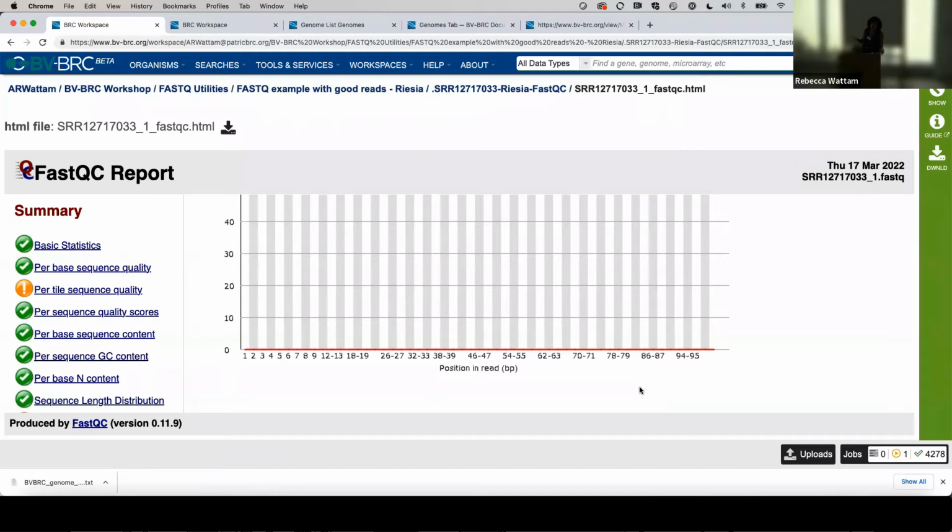WGS is whole genome shotgun, which is just, it's all in pieces and contigs. So when there's no gaps, when it's complete, and those are supposed to be the higher quality genomes for your analysis when you're comparing it to things, that means the number of contigs matches the number of chromosomes in the organism. And if it's truly complete, no ends.